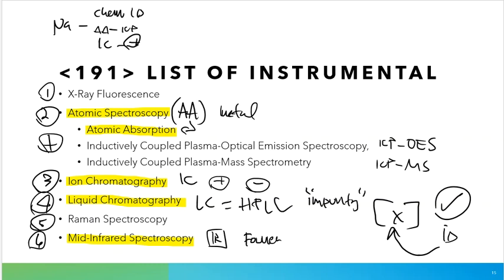This is the idea that certain compounds give us certain signals, and those signals need to be present in our instrumentation as we run them, if they are present. So we simply take a sample, add it to the FTIR or infrared, and we allow it to generate a signal, and then that machine will compare that signal to, yet again, a database that we've already talked about.